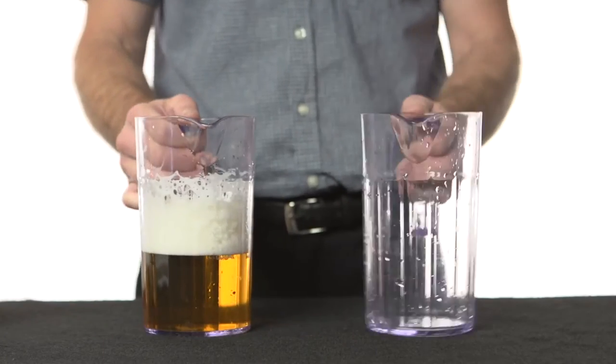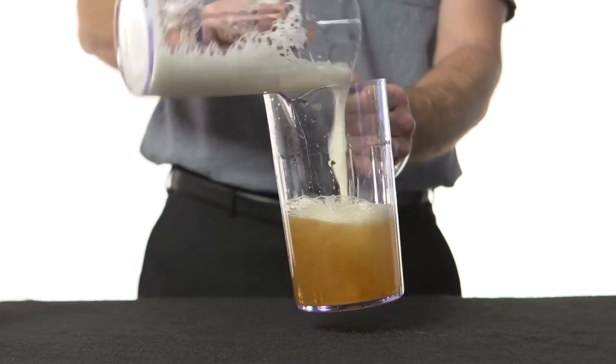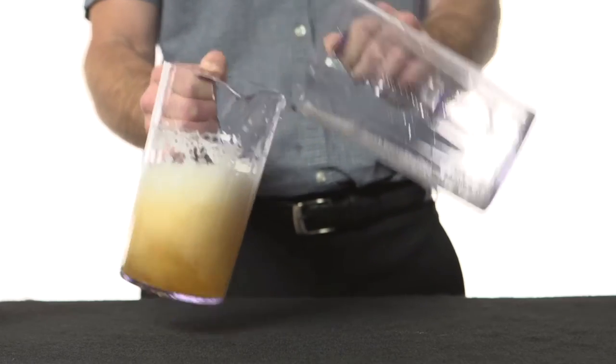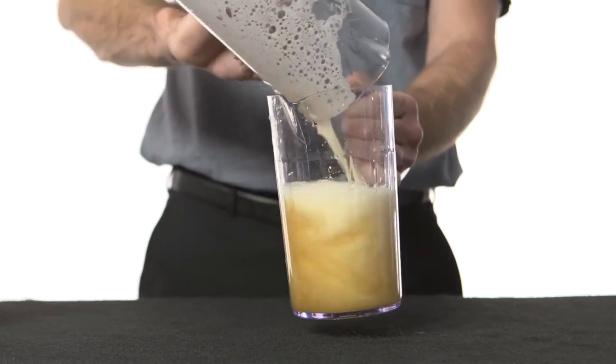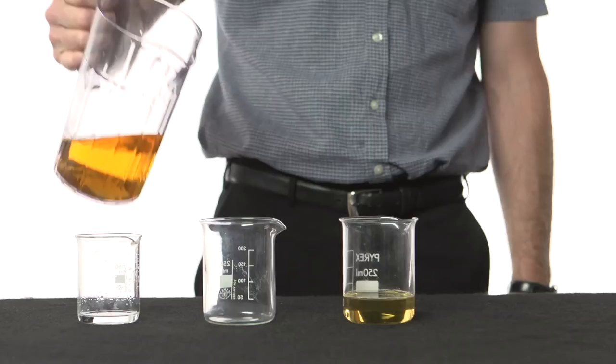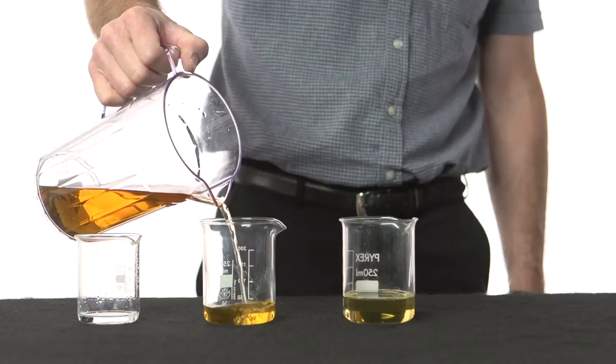The first stage of the test is to take the sample of beer and degas it in order to remove carbon dioxide bubbles, which can produce erroneous results. This can be done either through sonication or by pouring it from beaker to beaker numerous times. Once degassed, the sample is allowed to reach room temperature, 20 degrees centigrade.